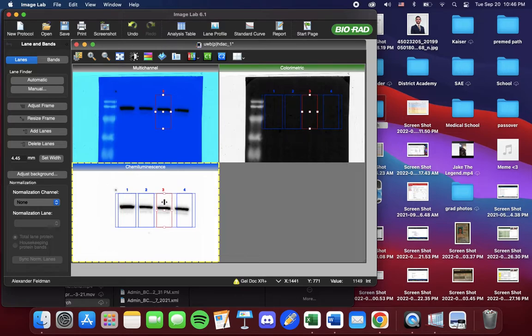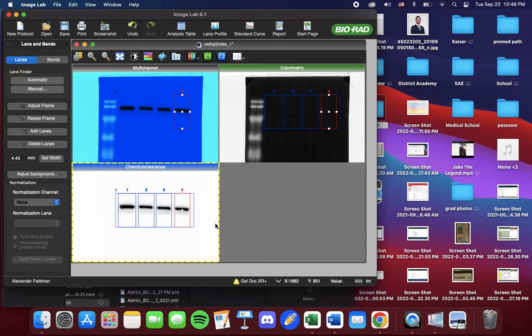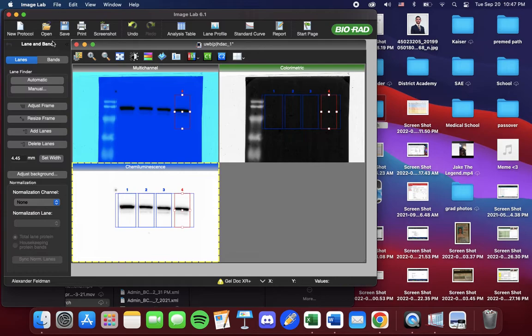And you select these corner boxes or these horizontal boxes in order to change the length. So again, I'm going to move center and center. From here, once you manipulated your lanes, you're going to go to Bands.